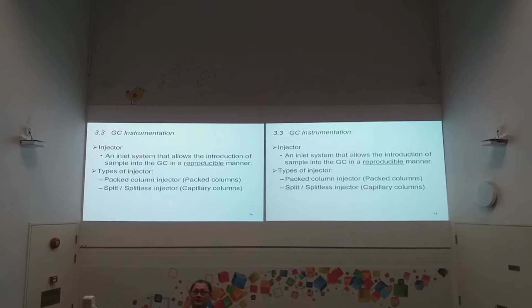I can repeat. Which compound is more suitable? Also, for the GC technique, it is more applicable in what kind of scenario? The thing is gaseous, right? You need to think about the nature of your so-called targets, the compounds you want to study. The condition is the compound you're going to study needs to be volatile. Right? You need to be able to vaporize them. Then you can surely consider this technique.